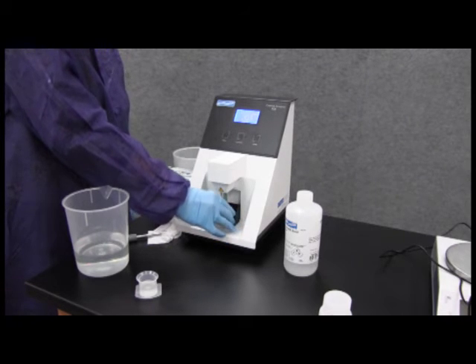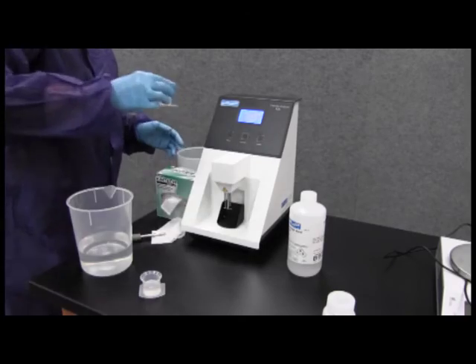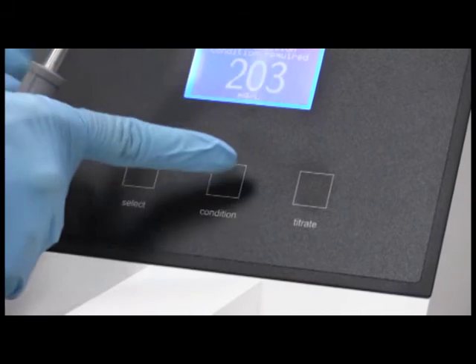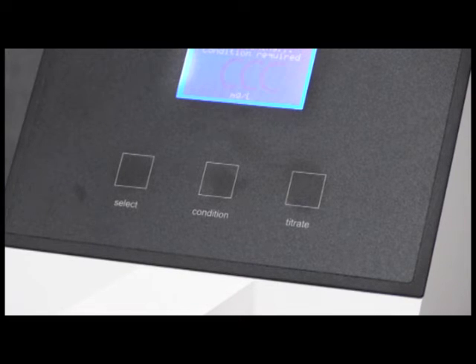After control check, discard contents of the beaker to waste. Refill with acid buffer. Add 500 microliters of standard and press condition. At the end of conditioning, keep cup raised and continue with product samples.